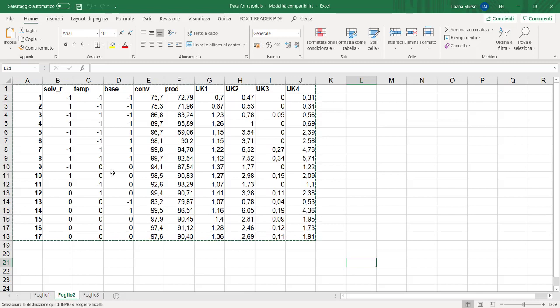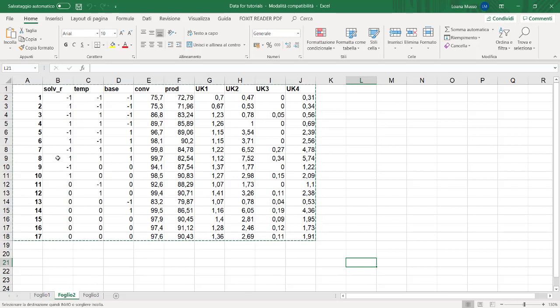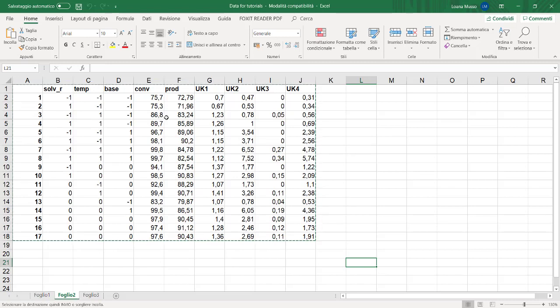The first three columns are columns from B to C to D, the variable columns, and from E to J are the responses. Here the numbers were retrieved from HPLC chromatograms and this is the area percent.